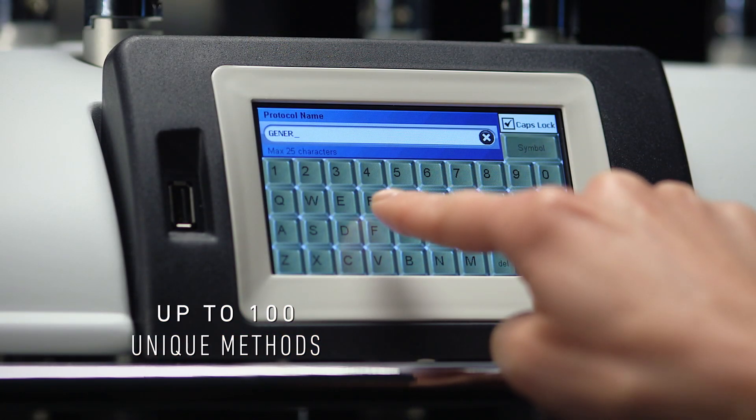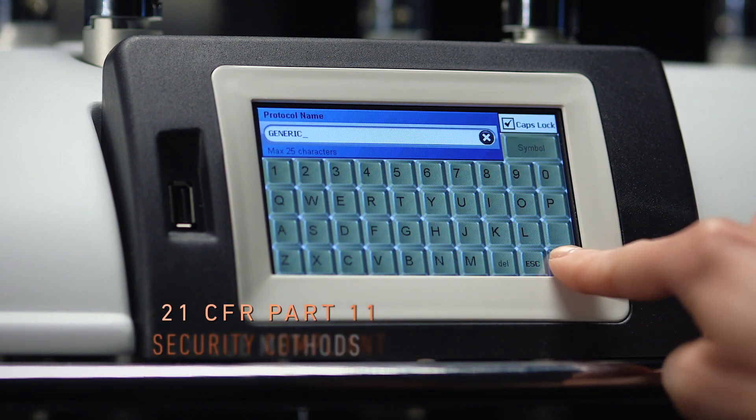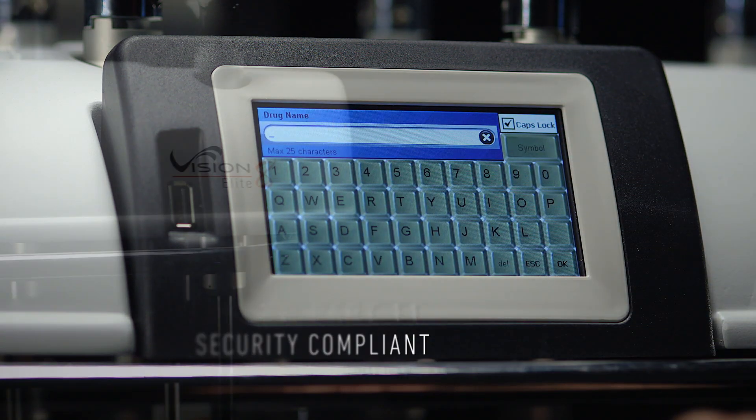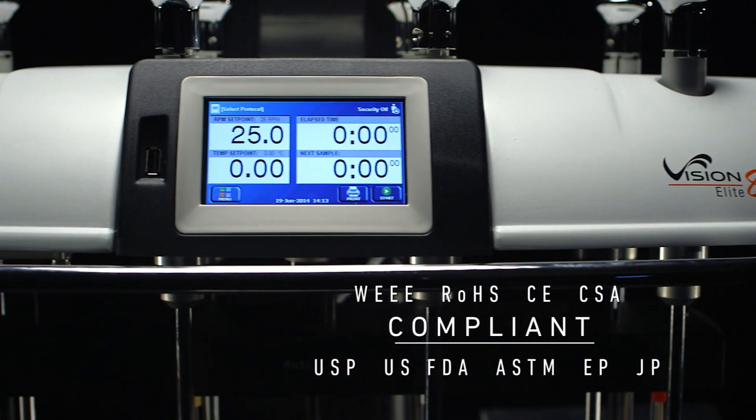Save up to 100 unique methods, including common library routines, with a 21 CFR Part 11 security compliance system. The Vision G2 Elite 8 meets and exceeds worldwide compliance standards.